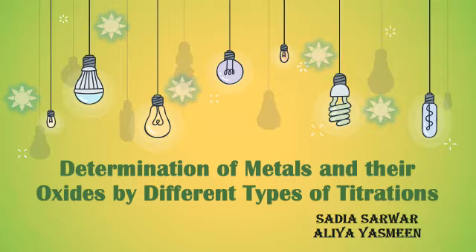Women University Rawalpindi. And our topic of discussion is the determination of metals and their oxides by different types of titrations including complexometric, precipitation, redox and acid-base titrations.